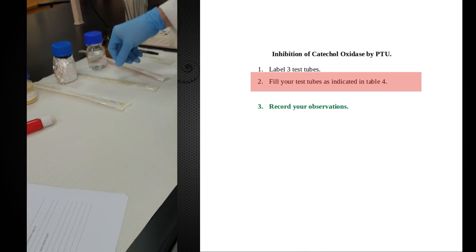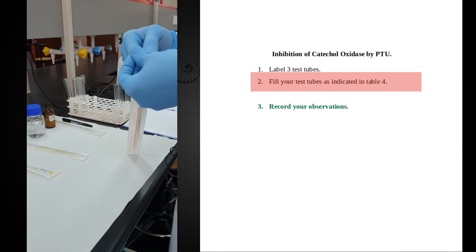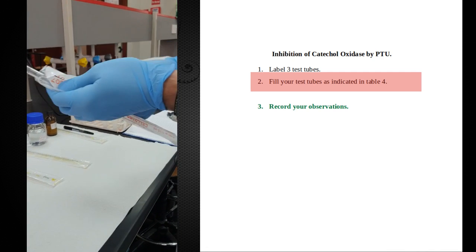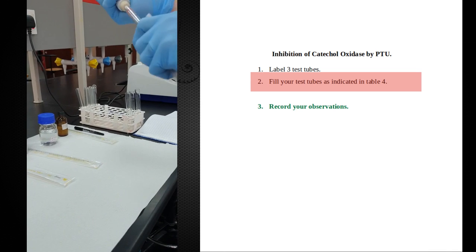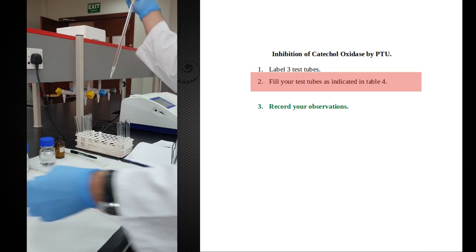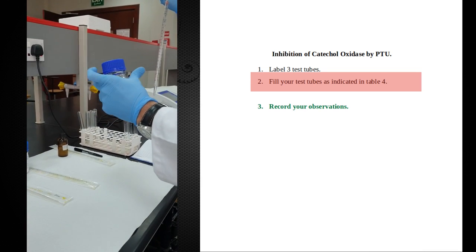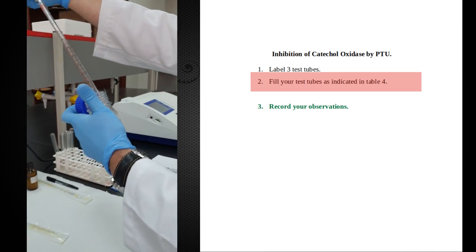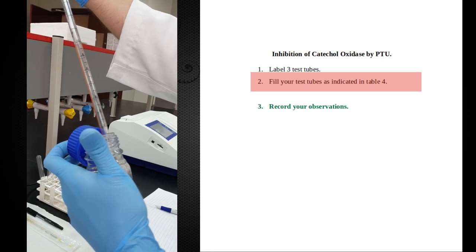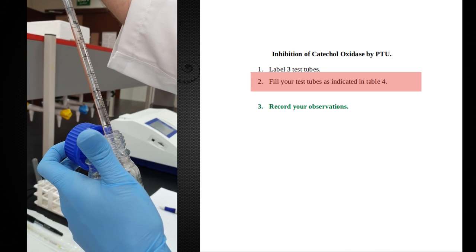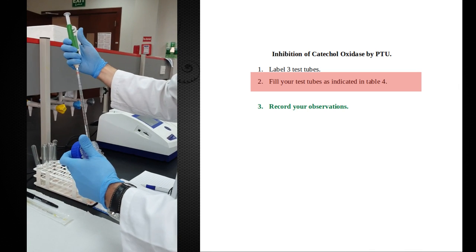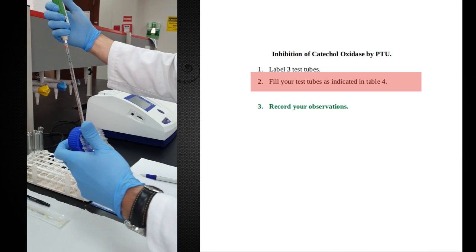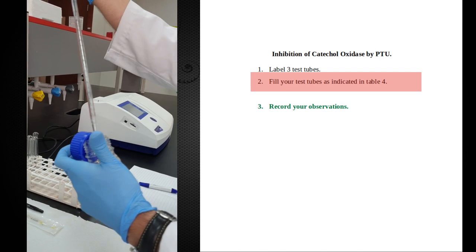I'm going to directly add the amount of water - either 5ml, 5.5ml, or 6ml. I'm going to open up the pipette aid. For the first tube I need 5.5ml of water. If you look at the small numbers on this pipette, right there is 5.5. It's going to go into the first tube. The second tube is going to receive 5 milliliters.